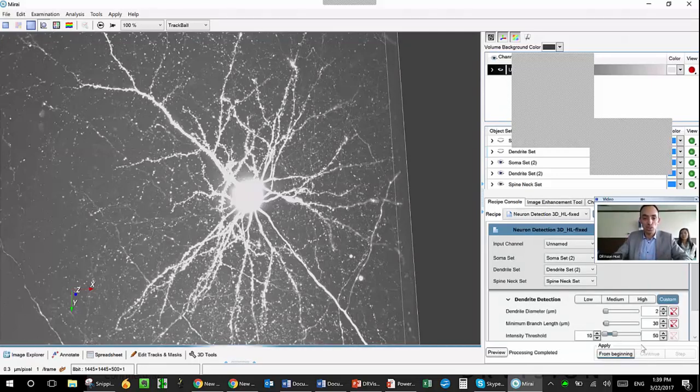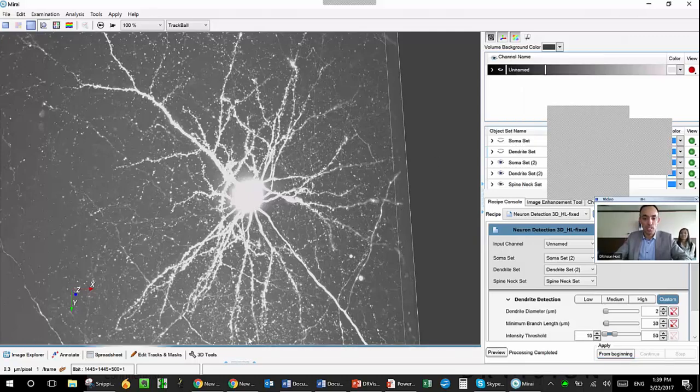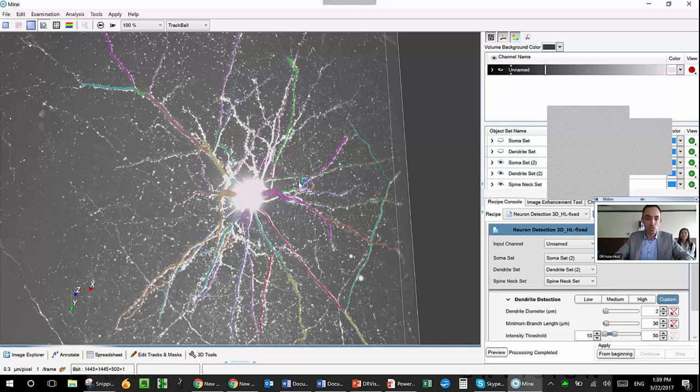You can see the result will be displayed momentarily on the scene here. It's already loading the result, so the algorithm part has been completed. That's a wheel that shows on the bottom right here. It's gone, and then we will see the result over here, and that's what you can already see in the colored beads. Again, we have a number of ways to represent the results. Right now we're doing it with colored beads, but they could be solid surfaces, or they could be this mesh that you saw on the video a moment ago.